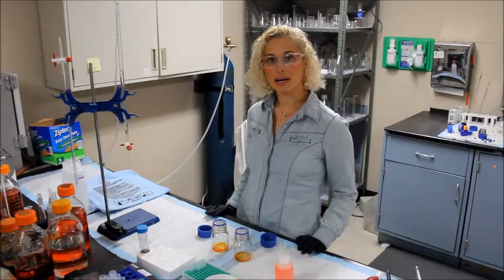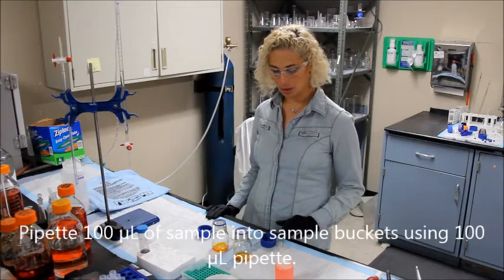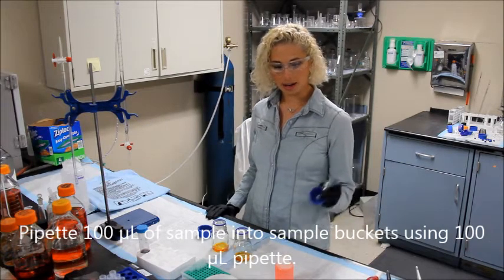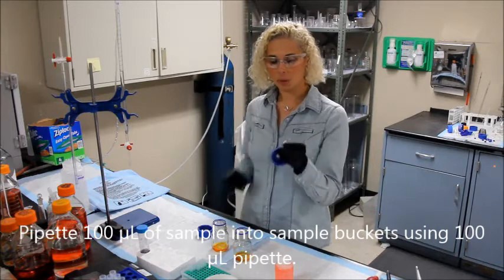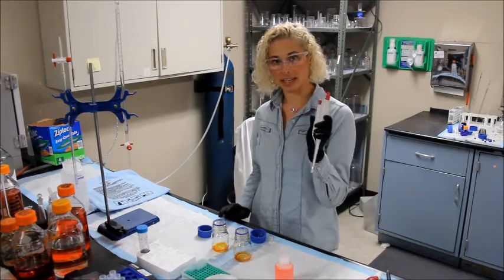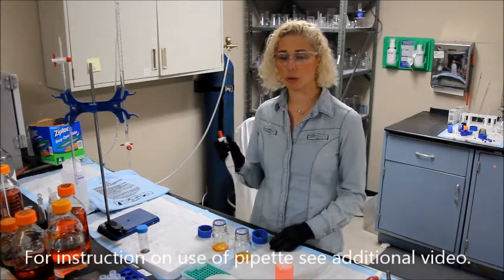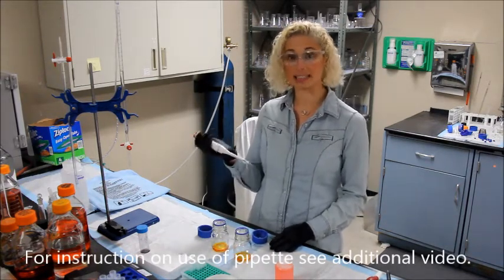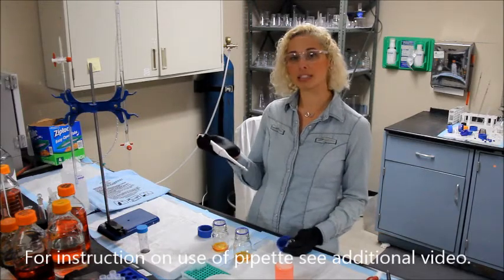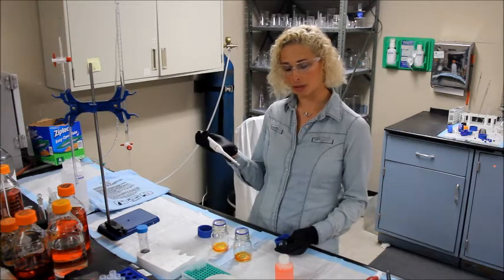Now you will pipette 100 µL of the sample into the sample bucket of the reaction bottle. We recommend using the 100 µL pipette provided in the kit. It is necessary to practice good pipetting technique. For more information on this, see the appendix in the manual or further videos for instruction.